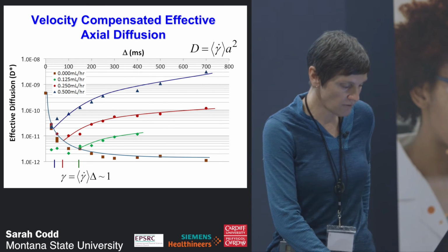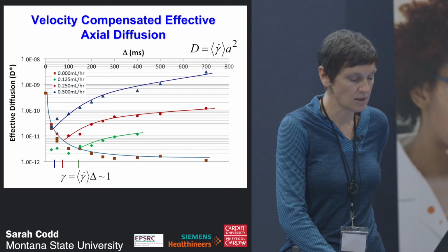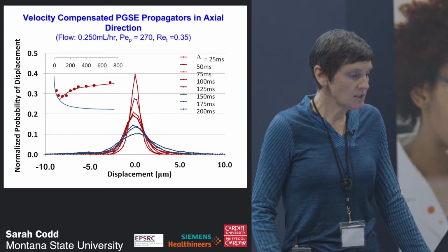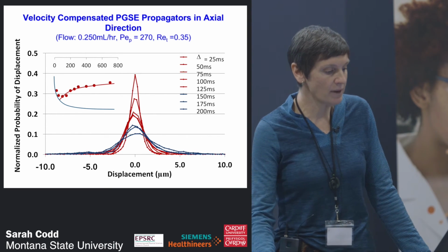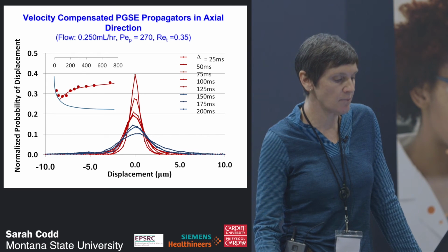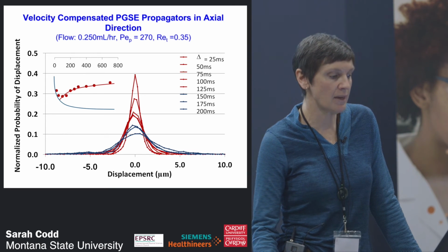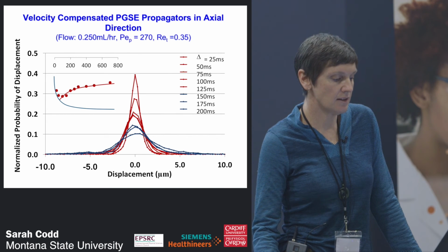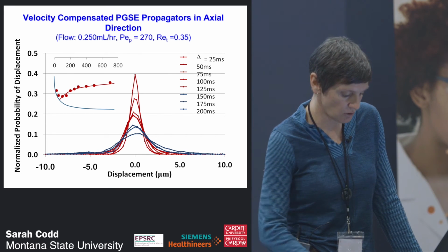They then see a higher dispersive motion due to the fact that they're moving out of that cage and experiencing the main flow. Looking at that in propagator space, the blue ones are the ones after things escape from that cage. You can see that you're getting Gaussian propagators essentially returned to you.